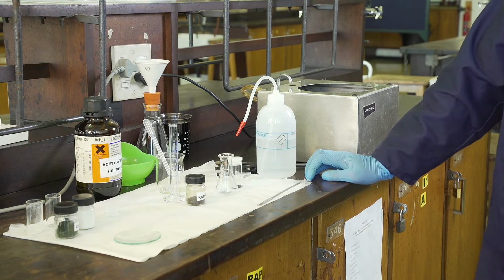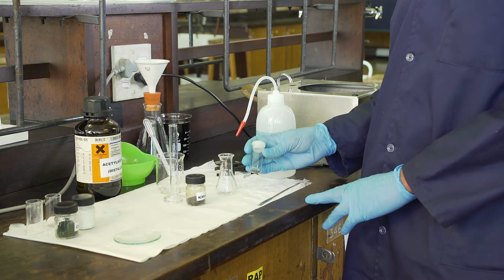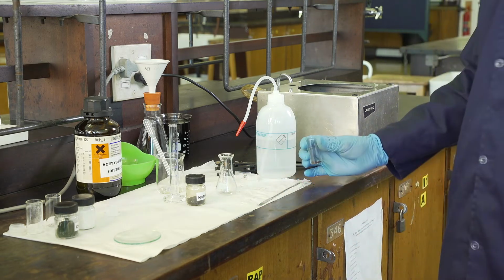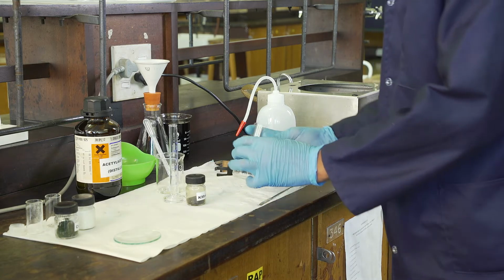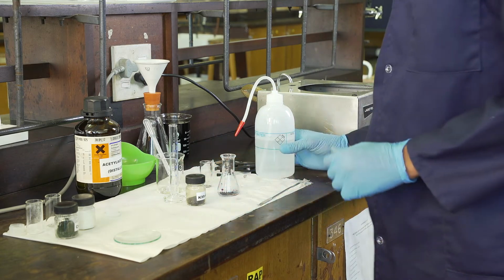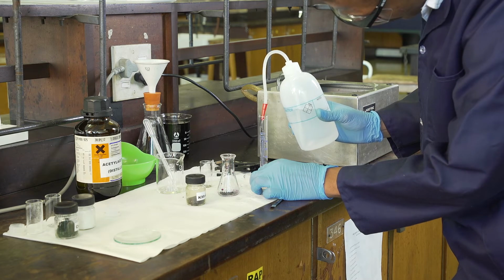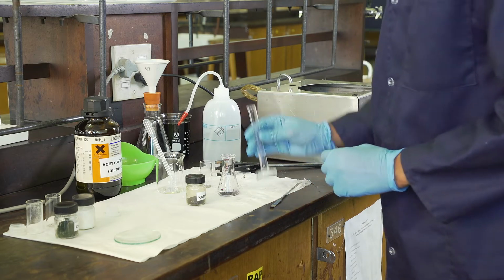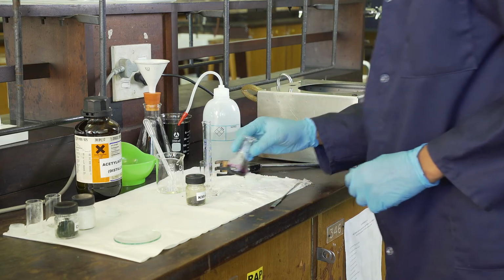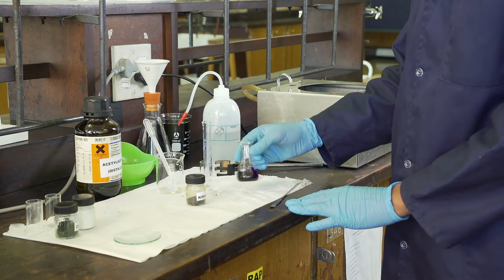For the preparation of our manganese acetylacetone complexes, we will accurately weigh 0.25 grams of potassium permanganate on an analytical balance and measure the mass to 4 decimal places. Once that has been done, we then transfer our potassium permanganate into our 25 ml conical flask and dissolve it using 4 ml of distilled water. This will be followed by gently swirling our flask in order to ensure complete dissolution of our potassium permanganate.